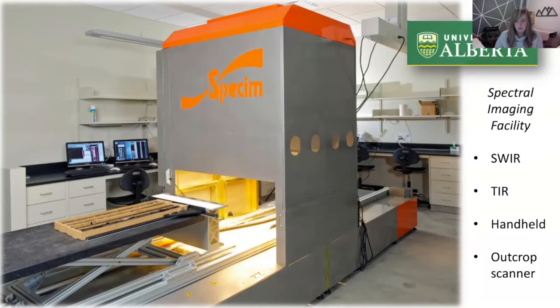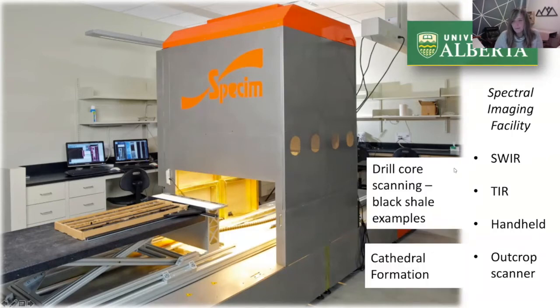So I'll be talking today about the drill core scanner with some examples from some organic rich black shales. And then with the outcrop scanner, we'll look at carbonates in the Cathedral Formation, which is a middle Cambrian formation exposed in the Rockies in Canada.